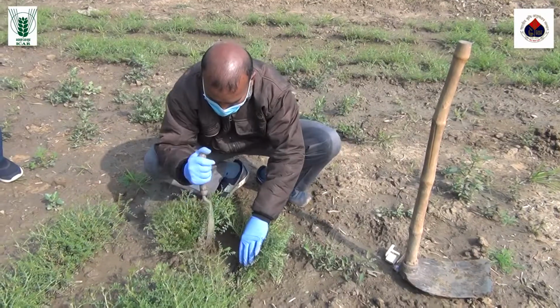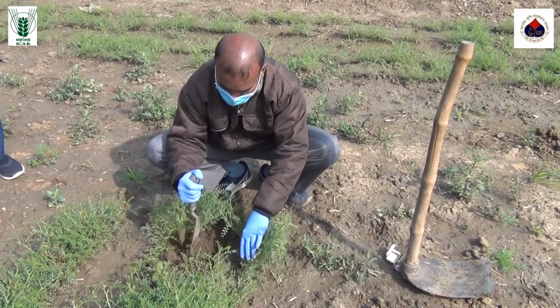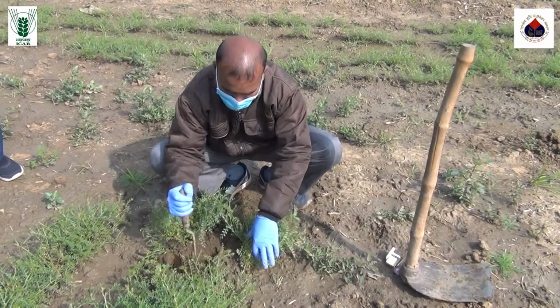or a little more than that, depending on the growth of the plant, so that you take out the maximum of the root portion. Like we have shown in the digging part, we mark it, remove as much soil as possible using a khurpi, and then use a spade to dig deep and extract the maximum.